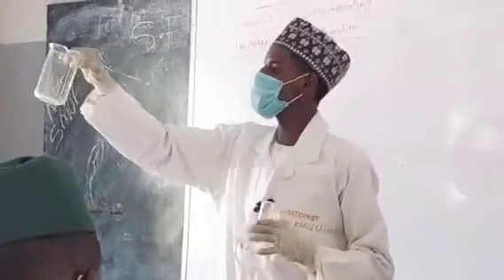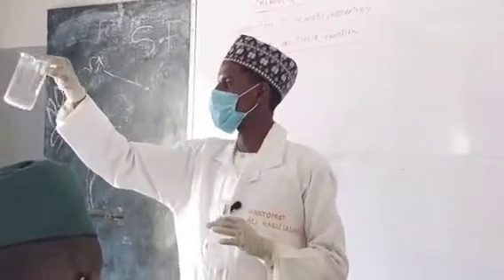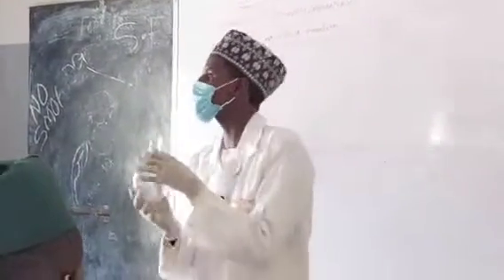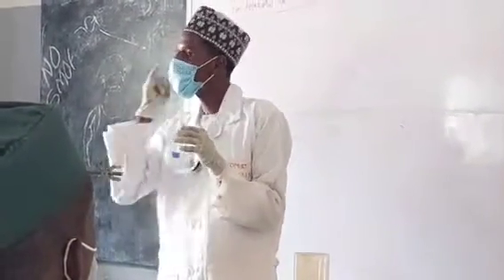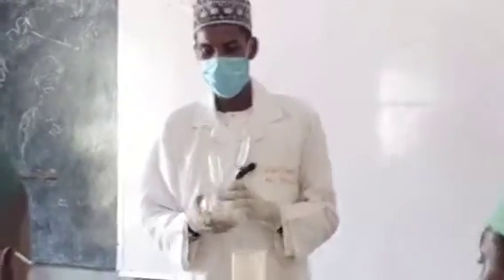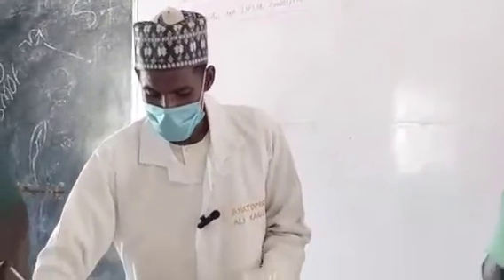Generally, beakers can be used for heating under low temperature. But apart from beakers, any glassware you want to heat must be Pyrex or borosilicate glass.